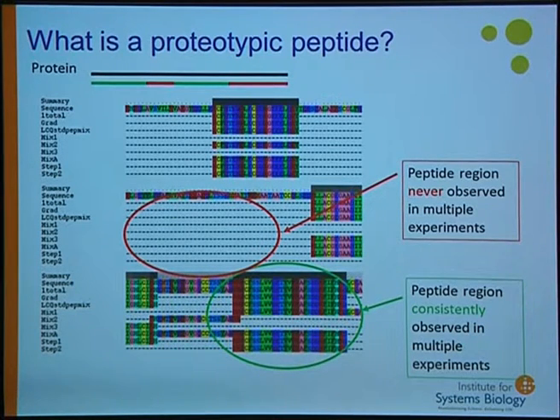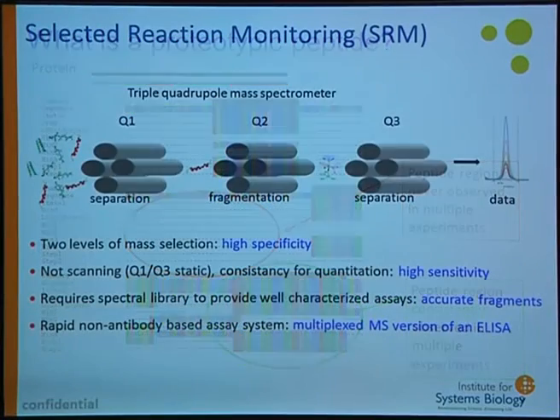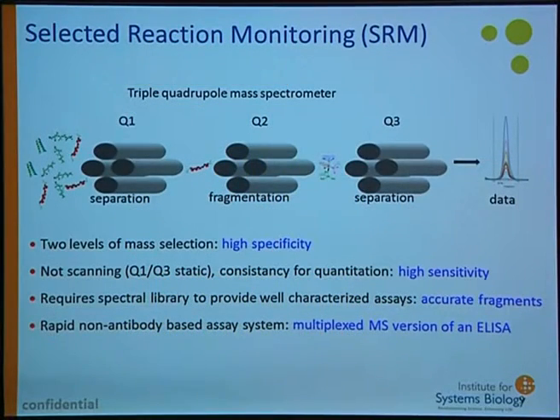And because we're using mass spectrometry, because we have limitations in mass range at the moment, until we get to these newer technologies that can do whole protein analysis, we're still looking at these fragments of proteins as sentinels or signatures that we can use to, one, identify the protein, but more importantly, two, quantify the protein. And one of these aspects is what we're also going to talk about. So Ulrika will talk about selected reaction monitoring.